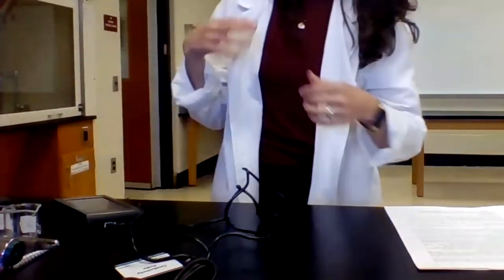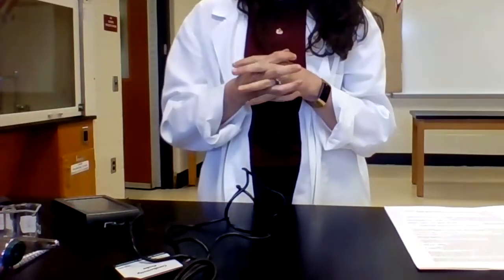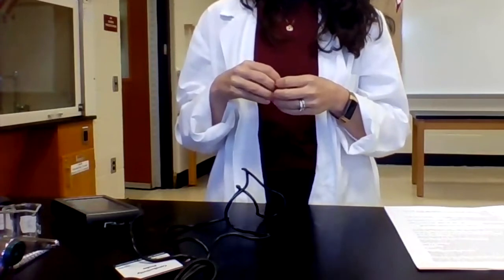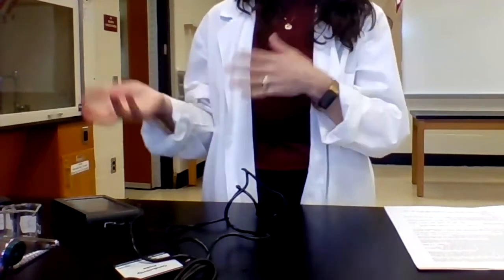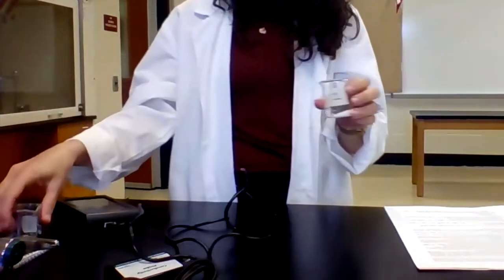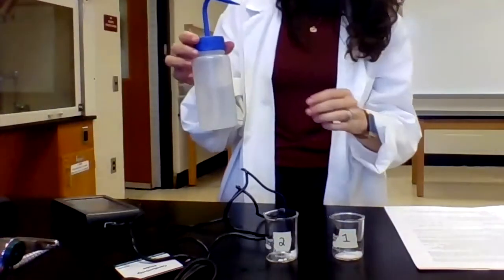We know that ionic solids should be excellent conductors in aqueous solution. Polar covalent compounds, if they are acidic, could have some conductivity due to the H+ ions, but they shouldn't conduct as well as an ionic compound, assuming that the polar covalent compound is a weak acid, not a strong acid. So I took a little bit of the solids, put them in different beakers here, and I'm going to add some deionized water.